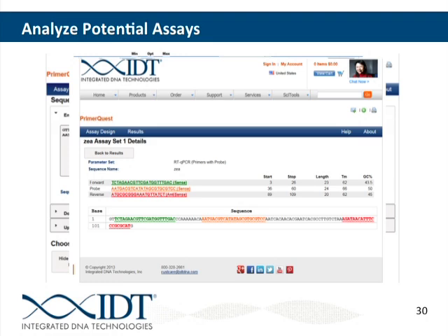80 bases. 80 bases for this. So anything over 80 bases. PrimerQuest here will accept anything over 80. So if you put in 60 bases and go to submit, you'll get an error saying there's not enough sequence. Please supply at least 80 bases.